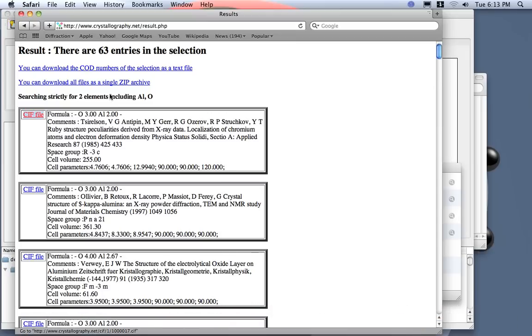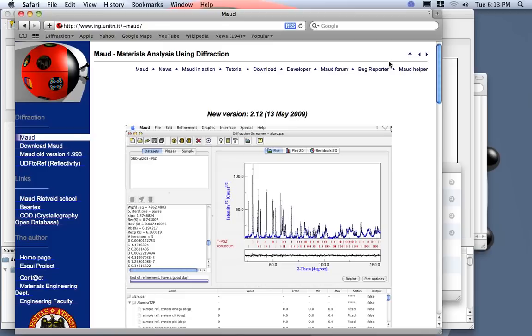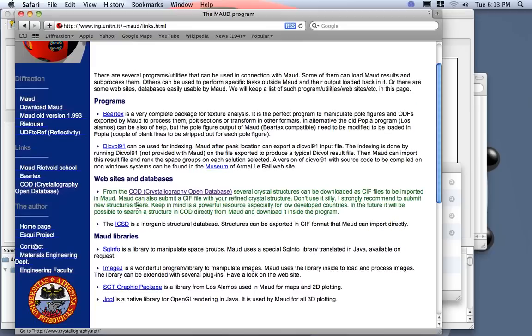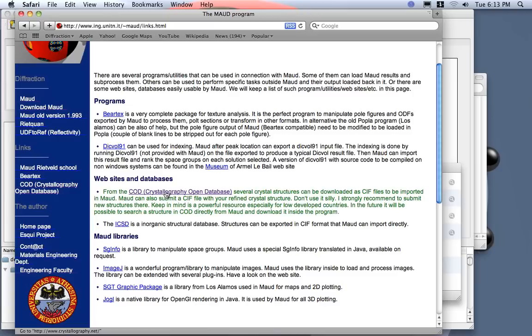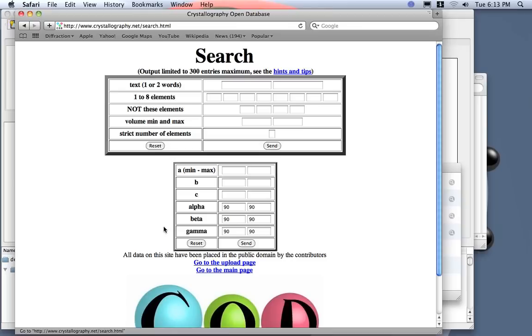Now, if I go, for example, here to the Maud webpage, I can click on the Maud helper and here there are some links for some of the database containing structures that can be loaded by Maud, useful for the Rietveld program. For example, a free one is the COD, crystallography.net, and we can search in the database to see if the corundum is inside.